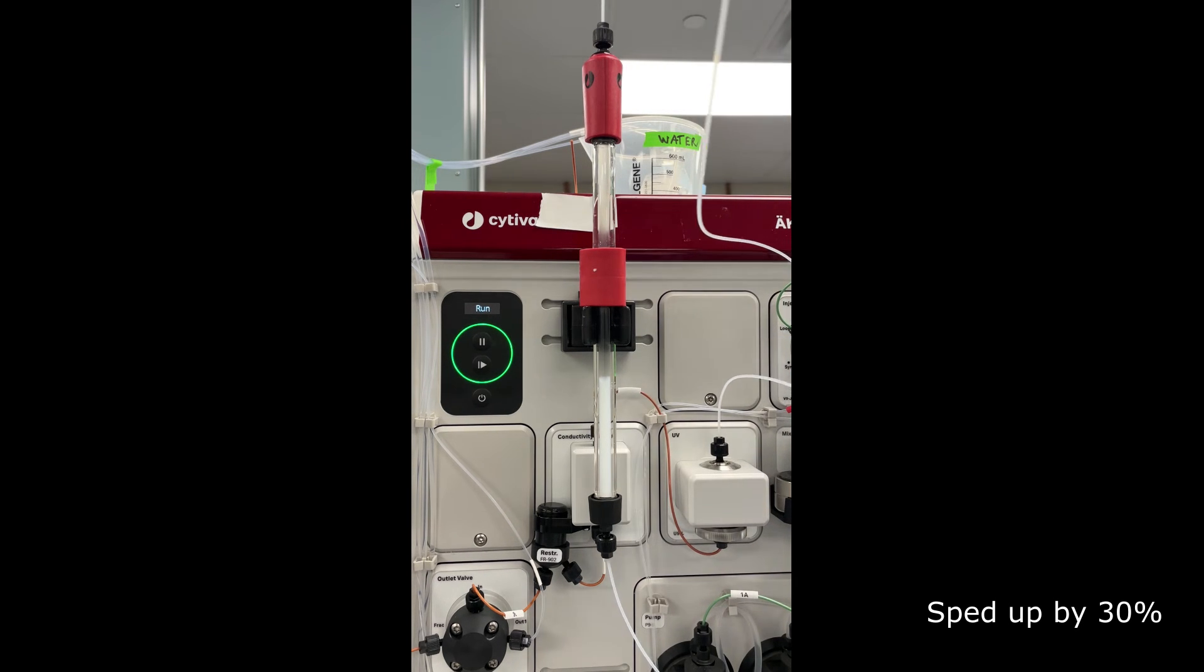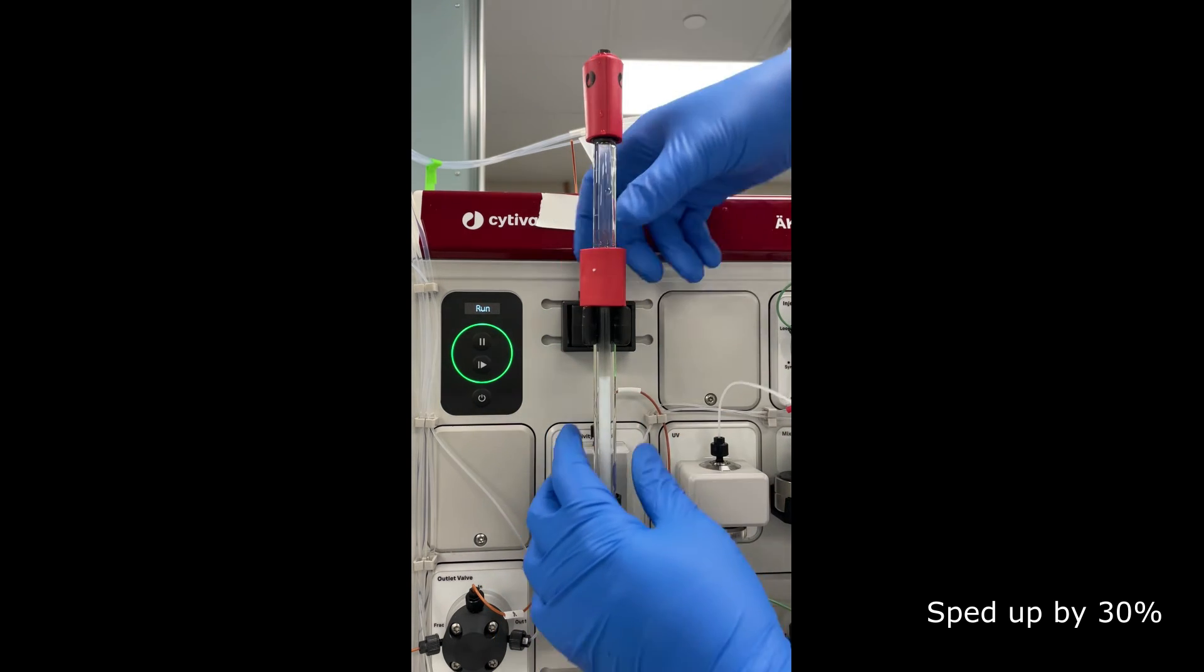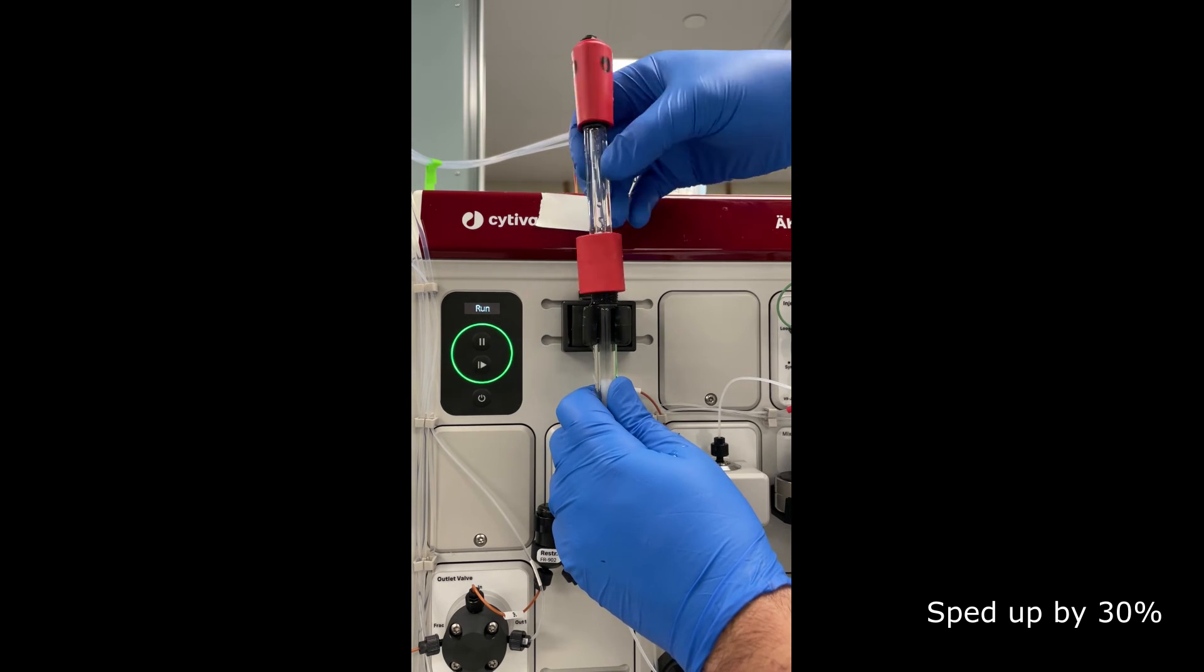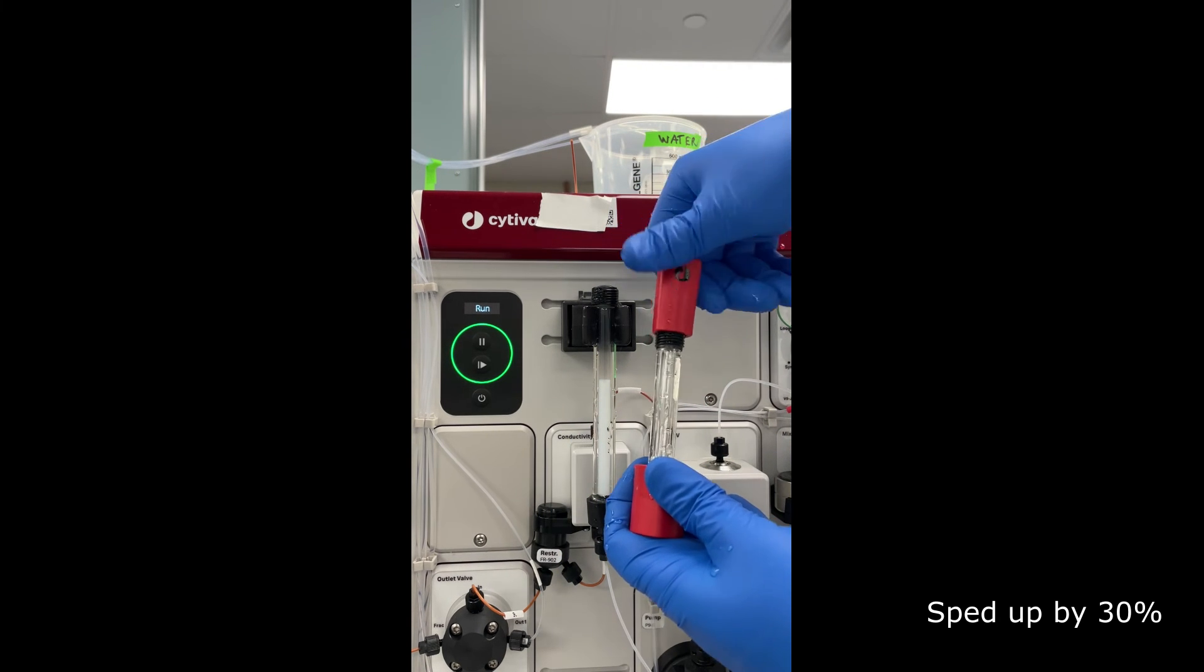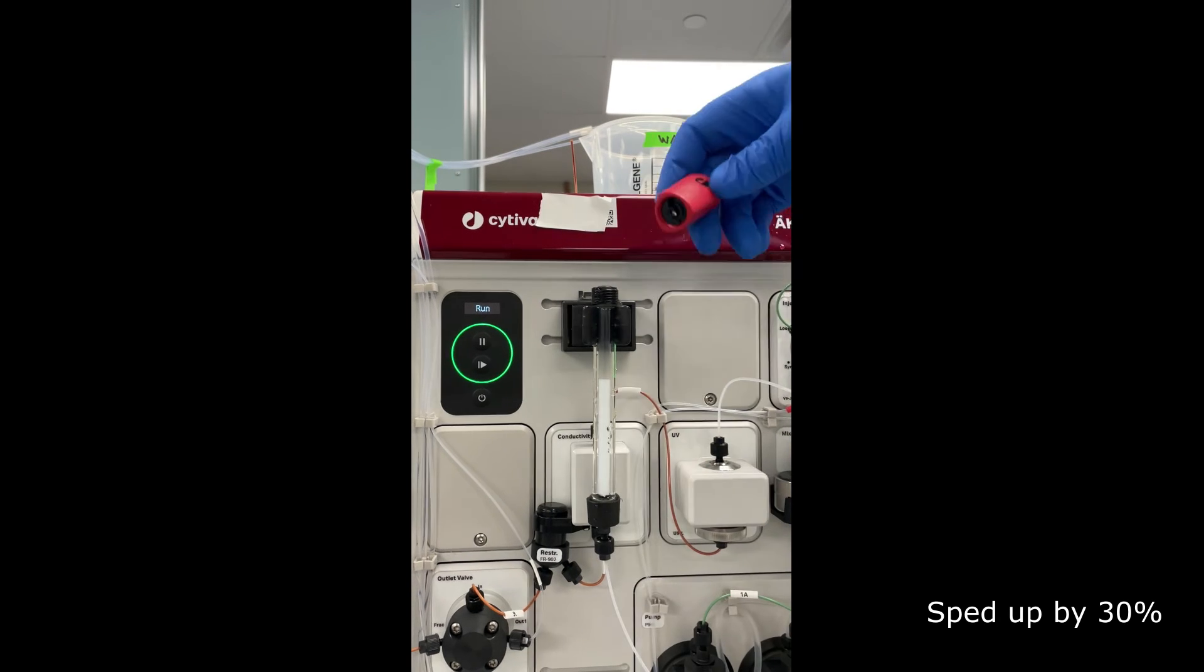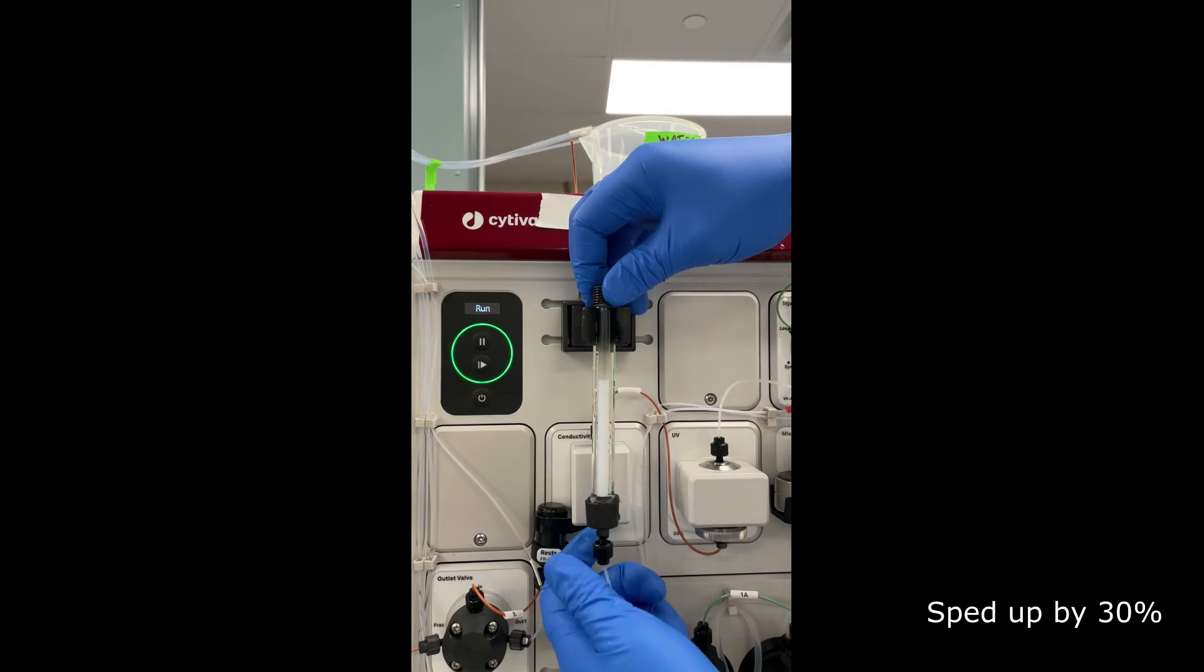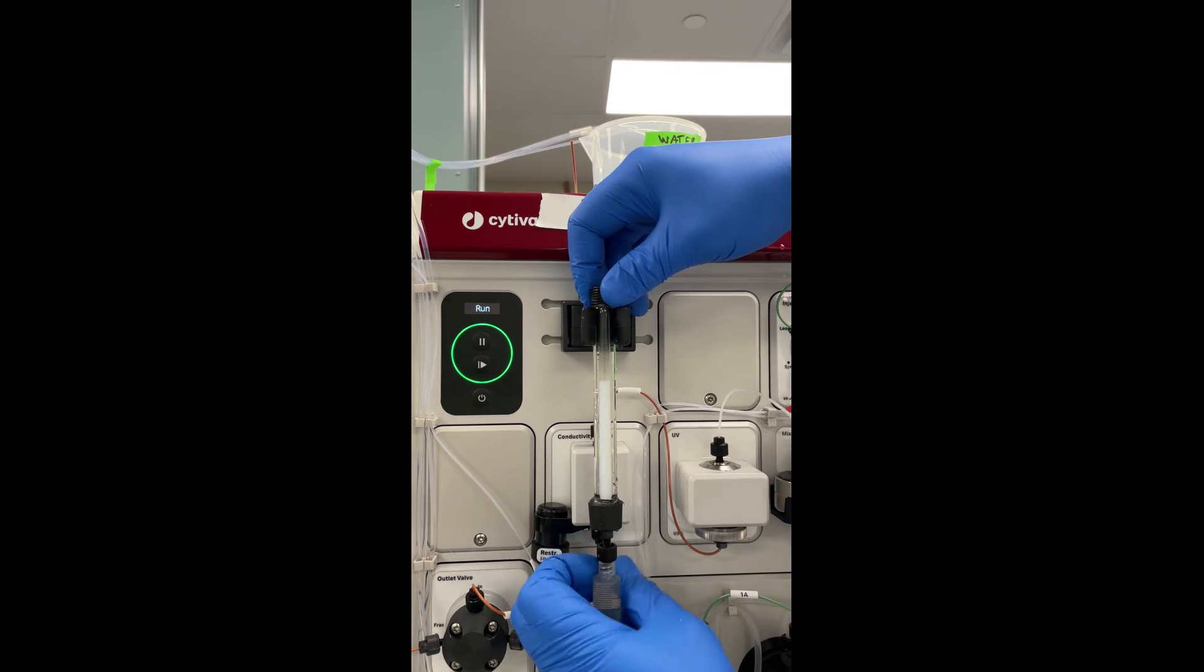When the resin bed is done settling, I'm going to check the height, which looks pretty good. Now I'm going to reconfigure the column so that I can remove the top packing adapter and packing reservoir, and also take the top adapter off. Then I'm going to put a syringe on the bottom just to secure the liquid in place, which I probably should have done first.